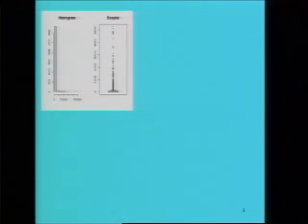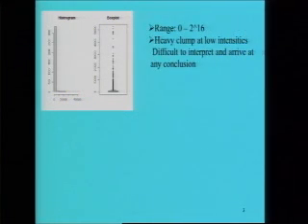As we have discussed in previous lectures, the first step is always to go for a transformation, because the histogram and box plot of expression values on any one of these arrays give us a picture where there is a huge bar at the lower intensities and almost negligible bars at the higher intensities. The box plot is barely visible because so many genes are expressed at low levels. This is bound to happen because of the experimental setup, as all these expression values range from 0 to 2^16. So there is a heavy clump at low intensities, and it is very difficult to interpret and analyze data when there is a huge variability of this order.